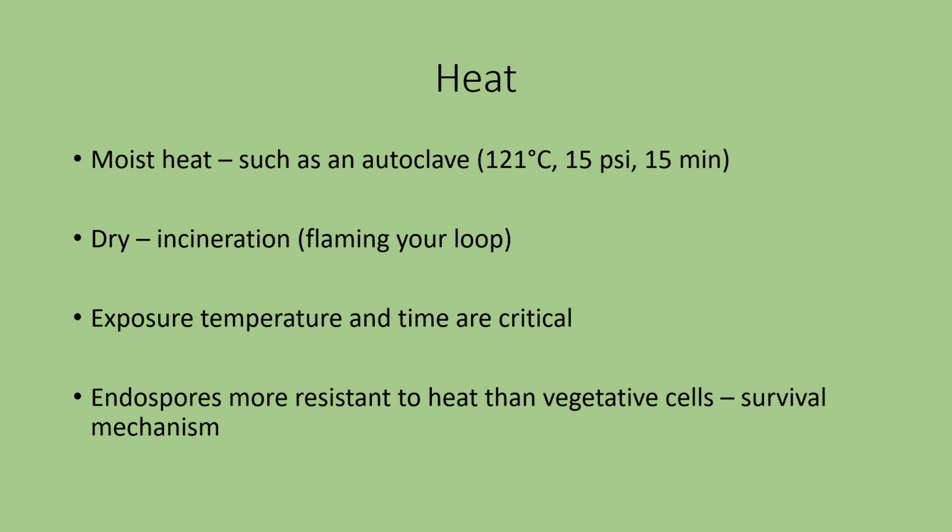With moist heat, such as the autoclave, yes, that should sterilize everything. One thing you have to keep in mind is whether the high temperature will have an adverse effect on your materials. Some things cannot be autoclaved.